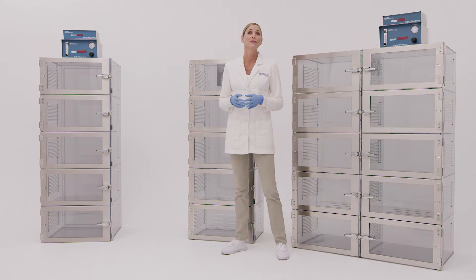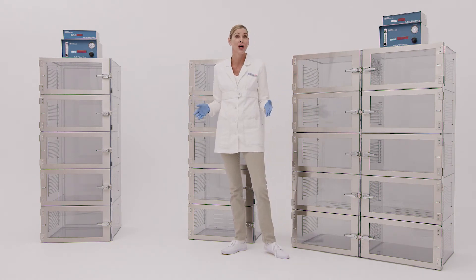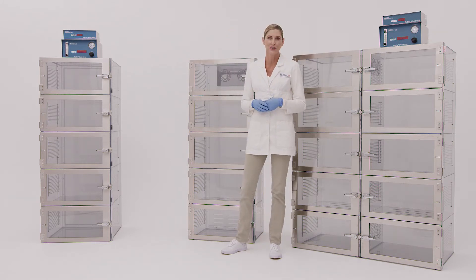The patented ISO-DRY system is the next evolution of Terra's Nitrogen Purge desiccator cabinet. For the fastest recovery rates and uniform humidity levels, you need an ISO-DRY desiccator.